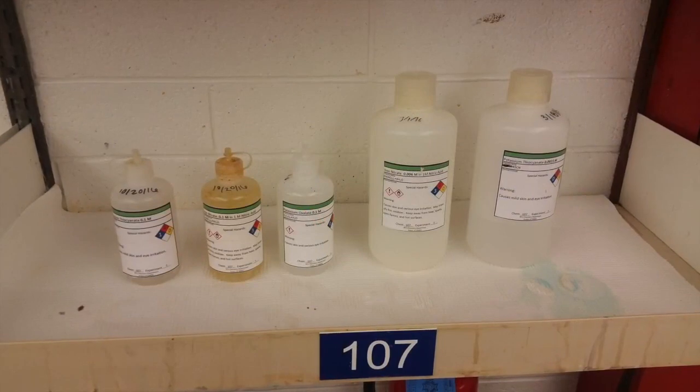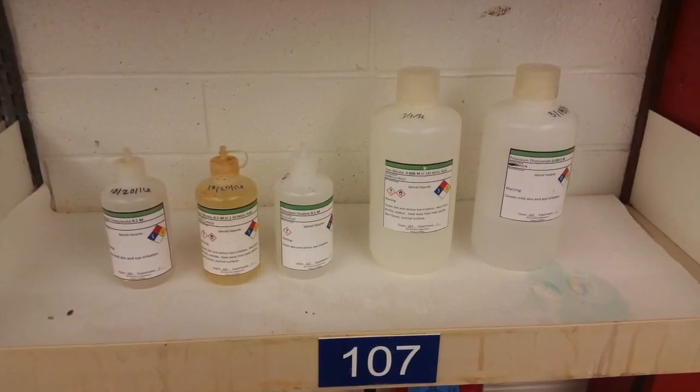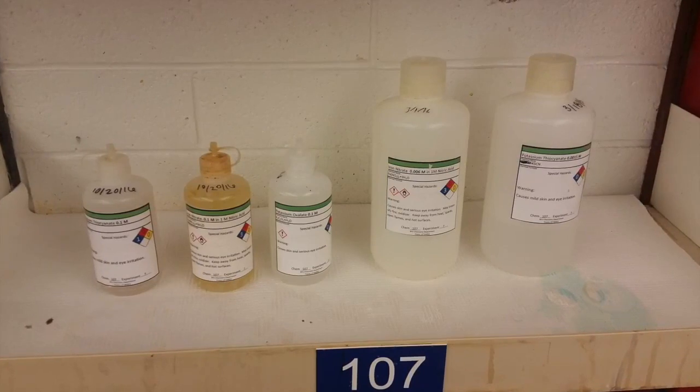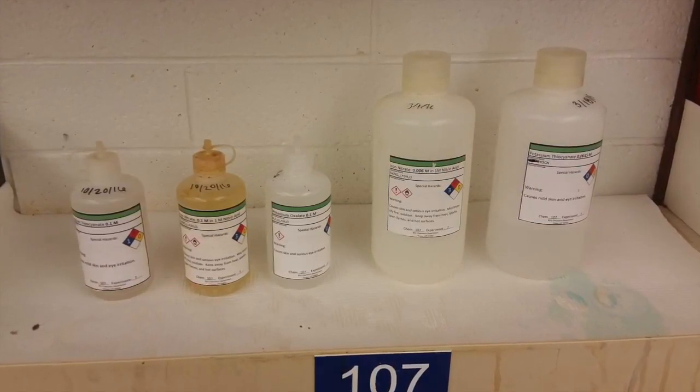Unlike other experiments where each chemical has only been in one concentration, in this experiment there are actually multiple different concentrations of the same chemical. So when you're getting your reagents you need to make sure that you're getting the correct concentration and the correct chemical.